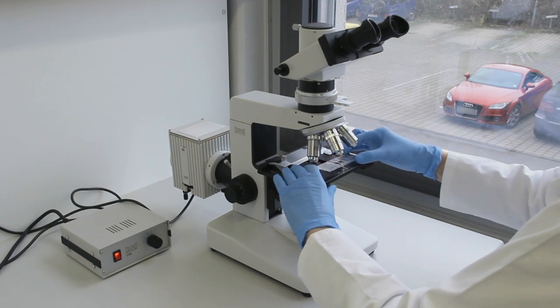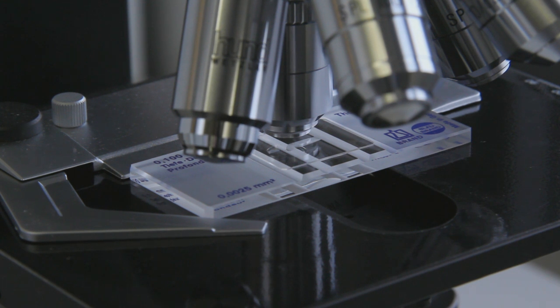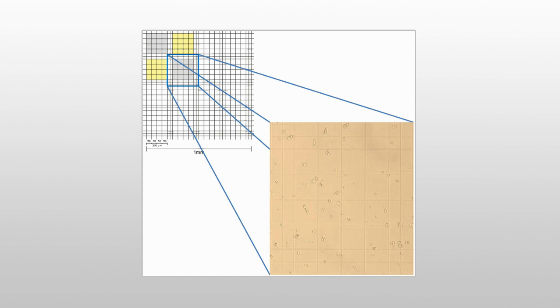Note that for evaluation of the cell viability, a 0.4% aqueous Trypan Blue solution can be added to the 100 µL cell suspension during cell counting in the thoma chamber.